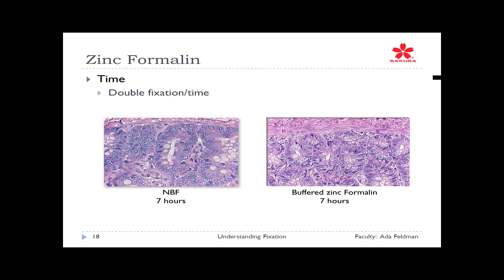Really in the 1980s, it really got familiar. Dr. Peter Banks at Mayo Clinic published a paper. It was a laboratory investigation, and he observed that if you use zinc sulfate in your 10% formalin, you got a great improvement in nuclear morphology using that zinc salt.